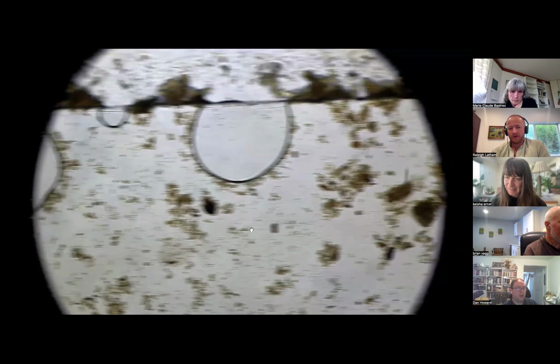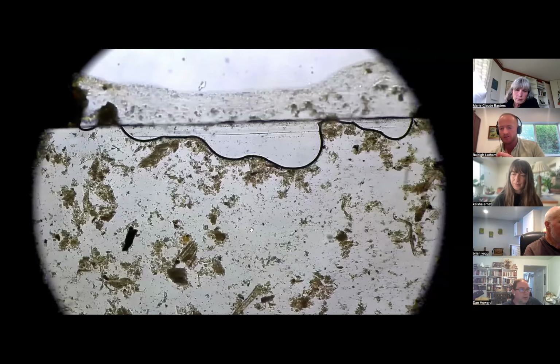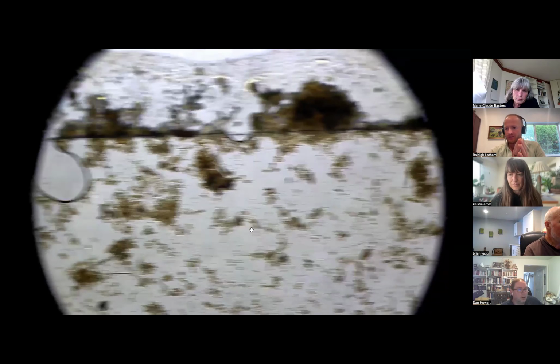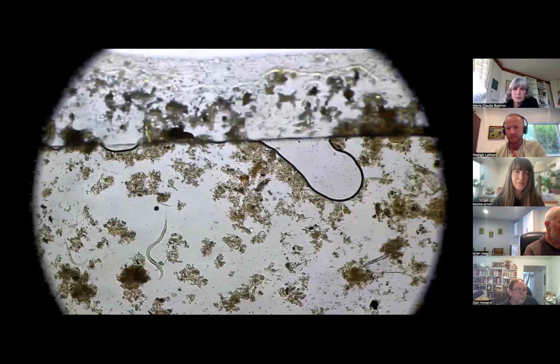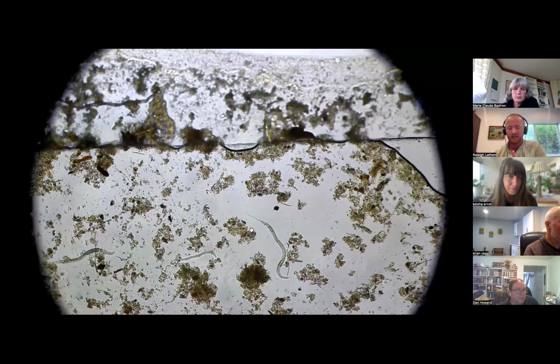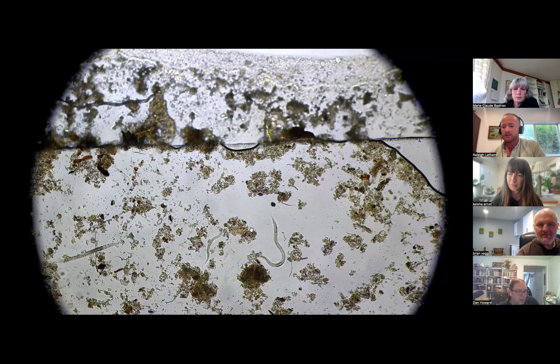It was so cool comparing this to Dan showing your compost. It was great because I felt like the compost I made was on that same trajectory as yours. Like, I maybe saw one nematode, but I'm seeing a good amount of testate amoeba, a good amount of fungi, and I know I got that backed up by Keisha and Brian. Yeah, you're on the right track. Even though I didn't make it past that third turn, after 6 months it still aged into really nice compost. Gosh, look at this nematode party.